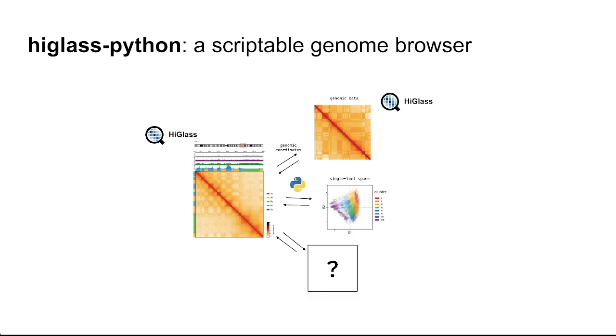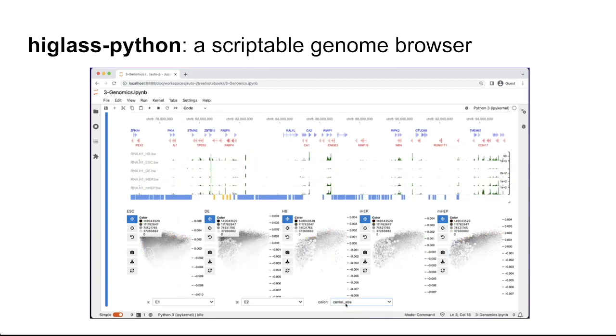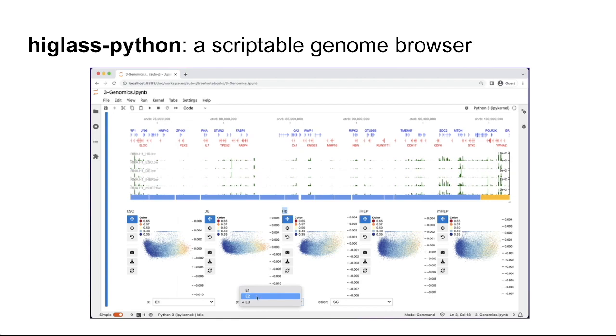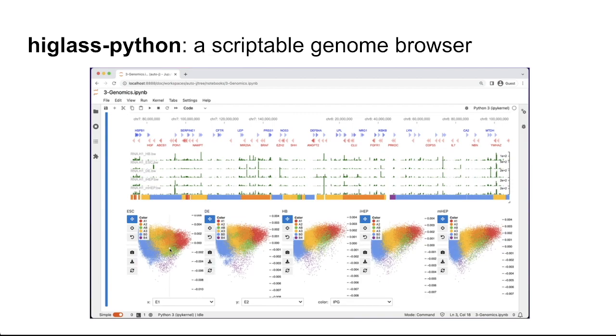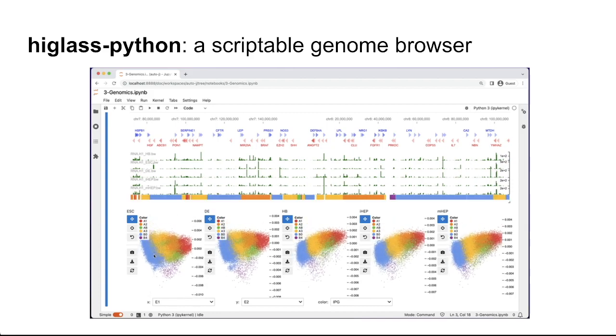For example, here we can link higlass-python to multiple scatterplots containing single loci projections of individual genomic loci. Here we have 5 separate stages of hepatic cell differentiation, which we can link back to the original genomic context. Points selected in the scatter plot that correspond to individual loci are highlighted in the genome browser track, and vice versa. This feature isn't available in most genome browsers, and because we're integrated into the Jupyter and Python ecosystem, it's easy to extend Higlass for custom-tailored interfaces that enable the exploration of the genome in novel contexts.